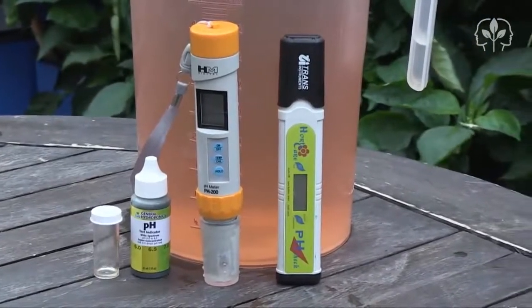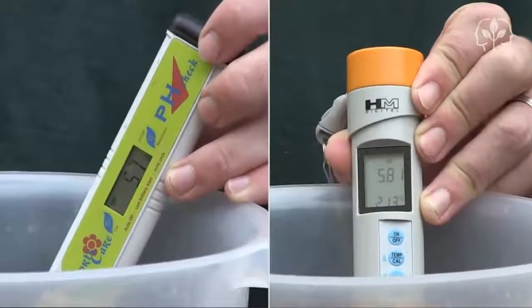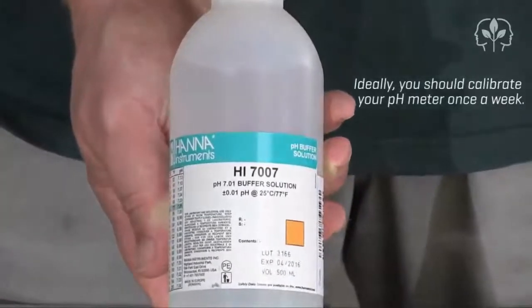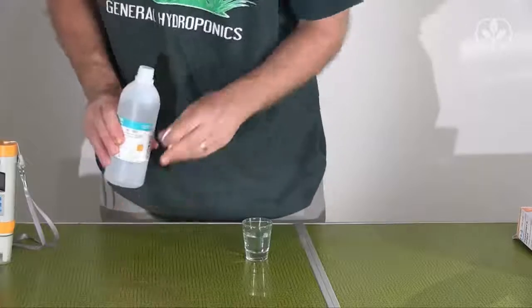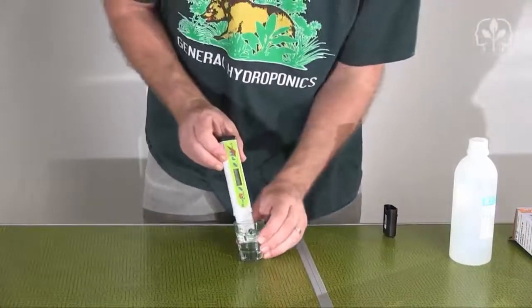But it's not a question of which one is right — it's a question of when they were both last calibrated. We're going to need some calibration fluid; this is simply liquid that's guaranteed to be at a certain pH, in this case 7.01. First let's test the HordiCare — it should be reading 7.0, but look at that, it's way up at 7.4. So we need to recalibrate.